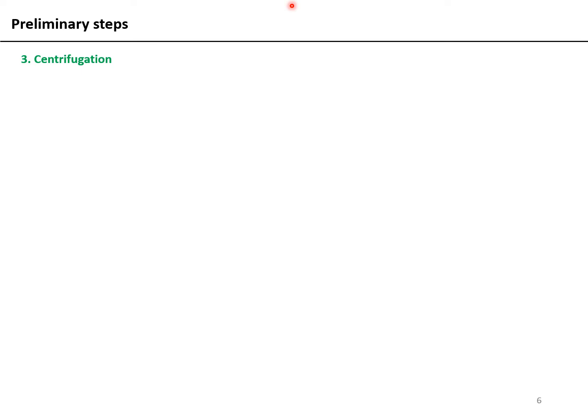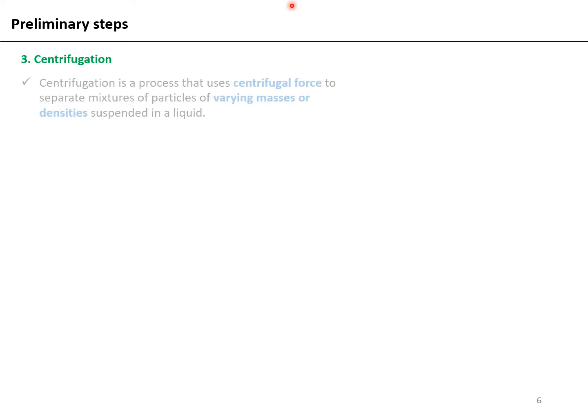But in case you are doing it, before you do it, you have to perform centrifugation to remove the cellular debris, and only then will you do ammonium sulfate precipitation and then another round of centrifugation to clear your load, the final load.